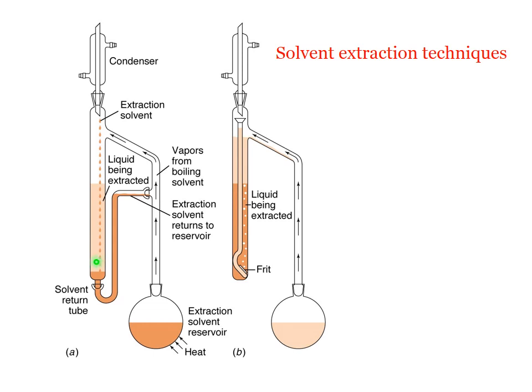In case I have a solvent heavier than water, droplets of boiling solvent, for example methylene chloride, come here and then through here come back into the solvent reservoir.